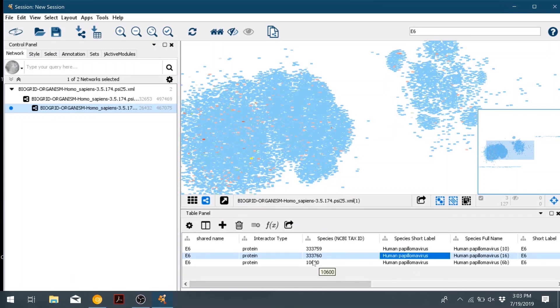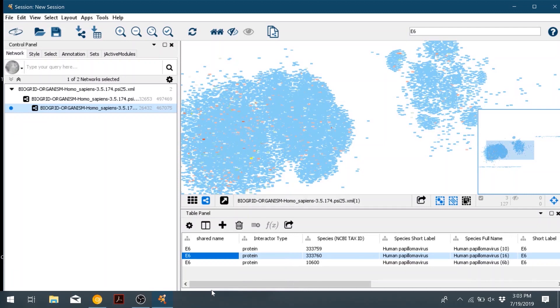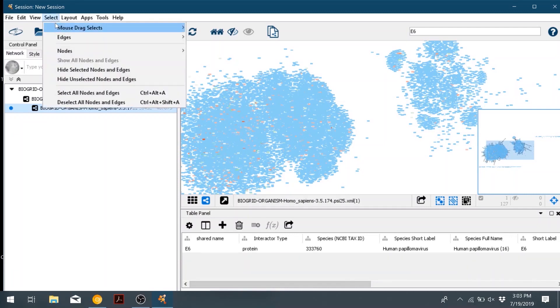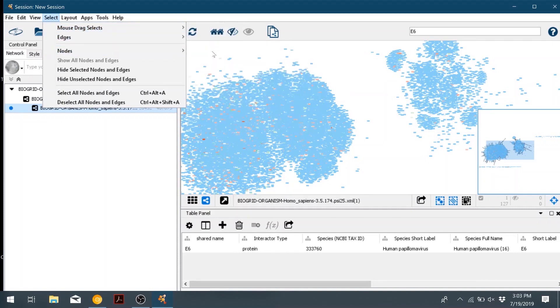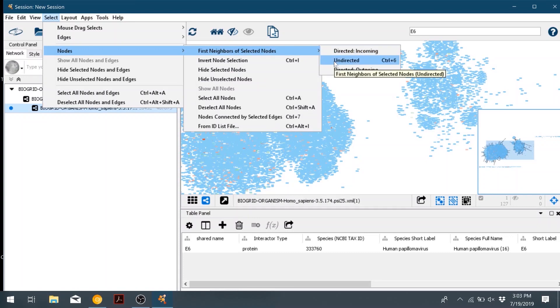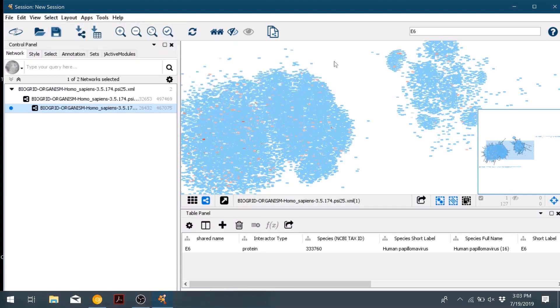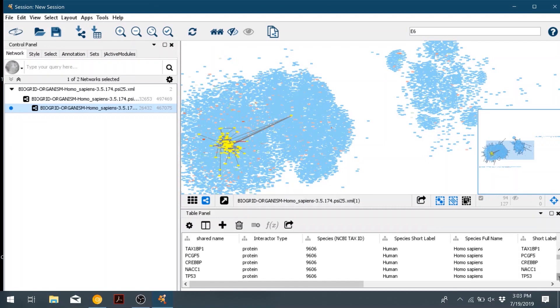Right click and go down to select nodes from selected rows. That will select just the HPV16 one. Go to the top and click select, and then nodes, and then first neighbor of selected nodes. And we'll choose undirected. And then that will select all of the nodes that interact with E6. If we scroll down, we can see all of them listed in the node table.